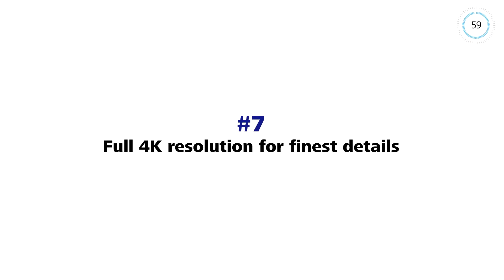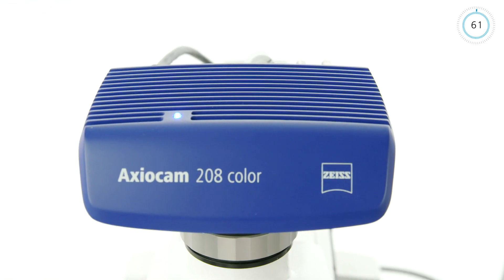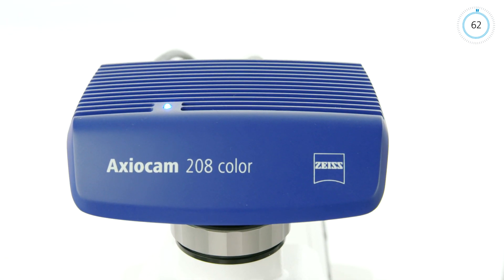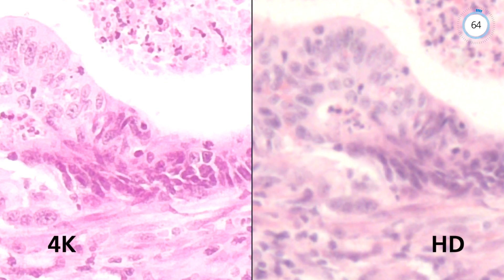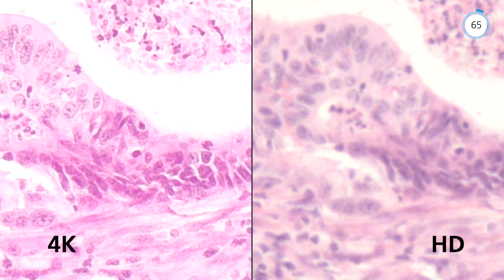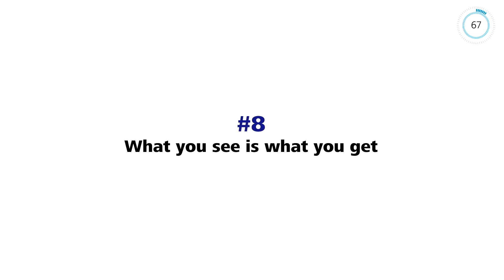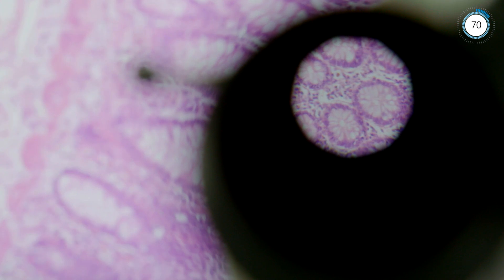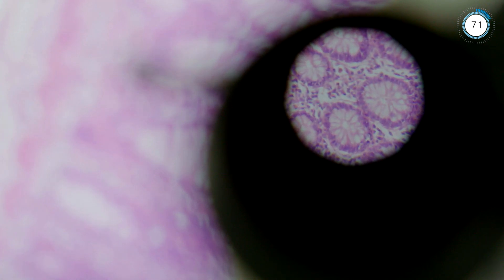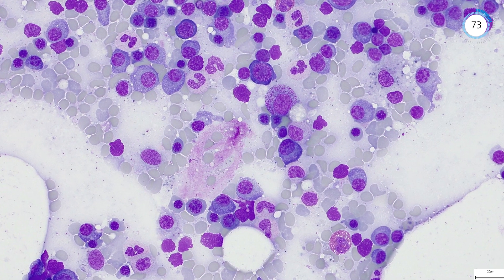Axiocam 208 provides live images with 4K resolution at 30 frames per second. Finer details are resolved and become discernible. Visualize and document your sample in natural colors where even subtle color differences are clearly visible.